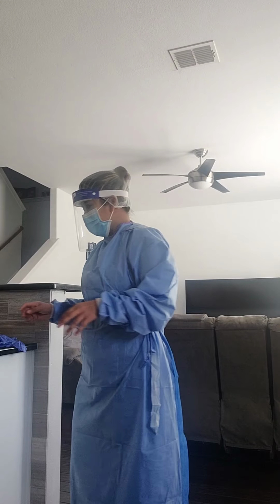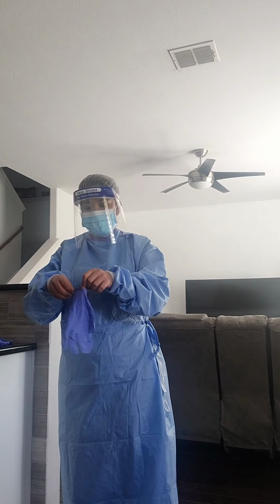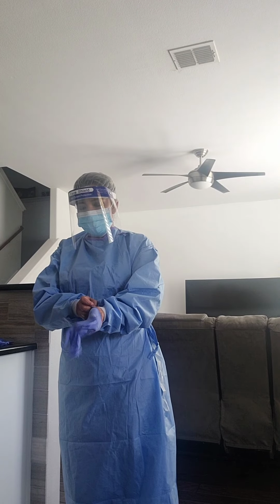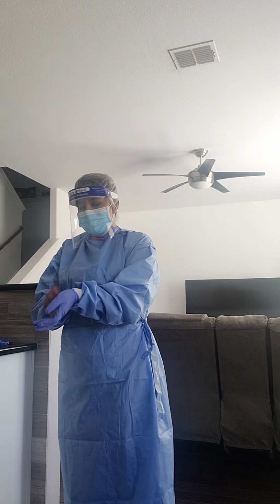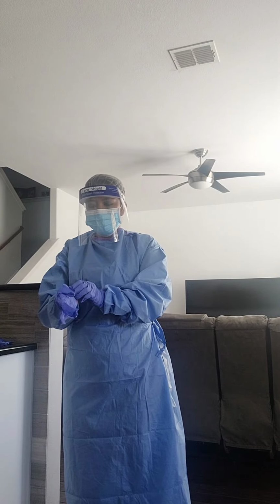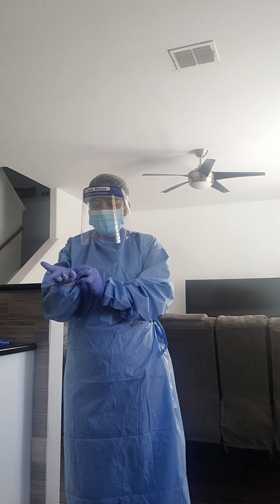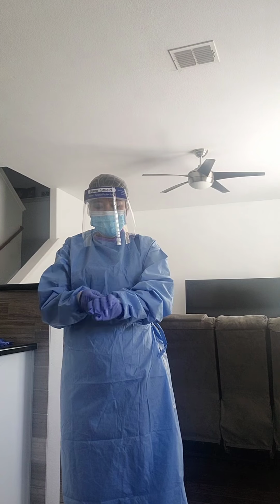My hands are dry. I'm going to put on my first pair of gloves. And I'm going to put the edges of the gloves under the sleeves of the gown.